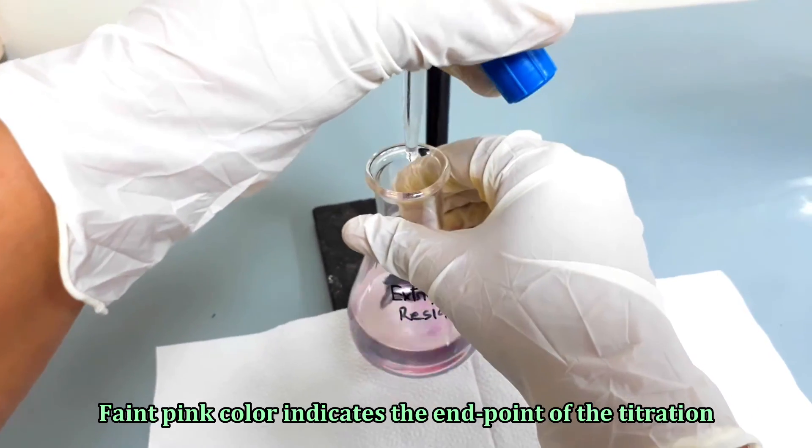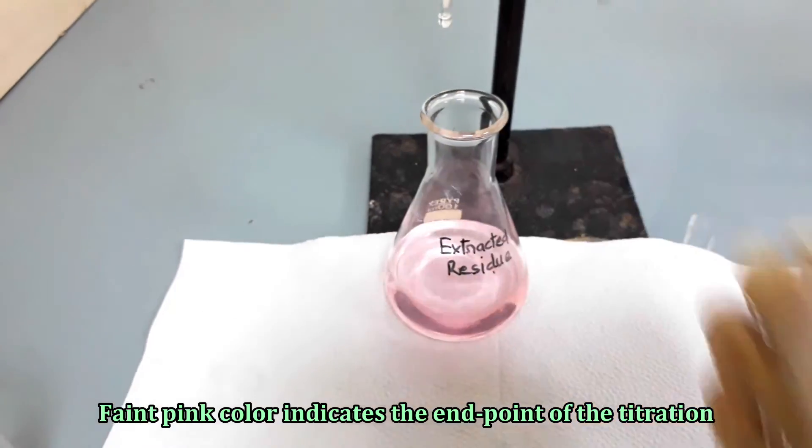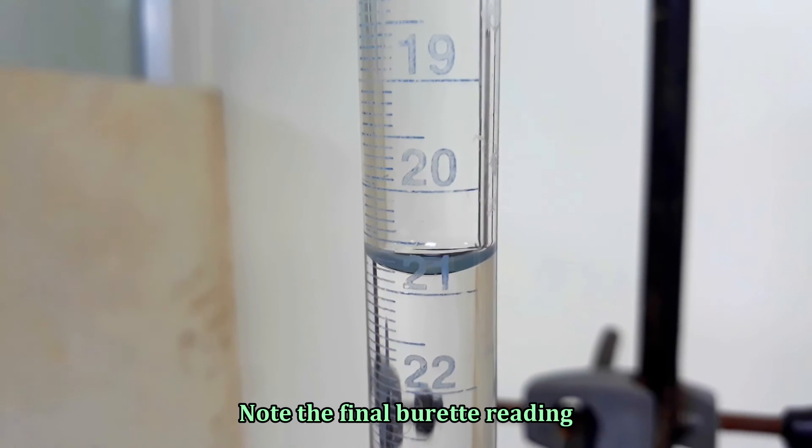A faint pink color indicates the end point of the titration. Note the final burette reading.